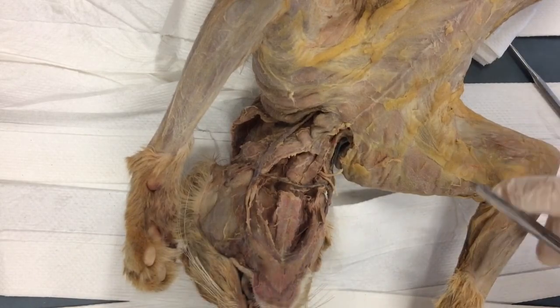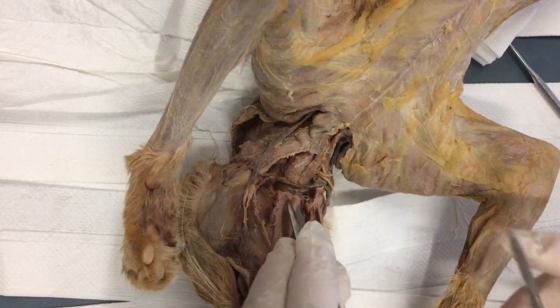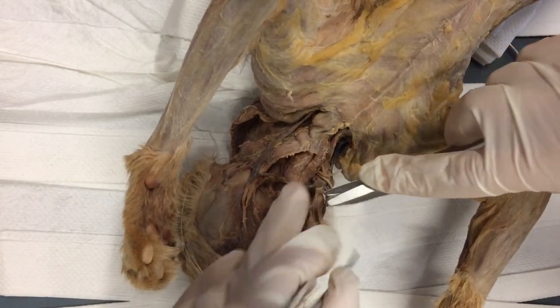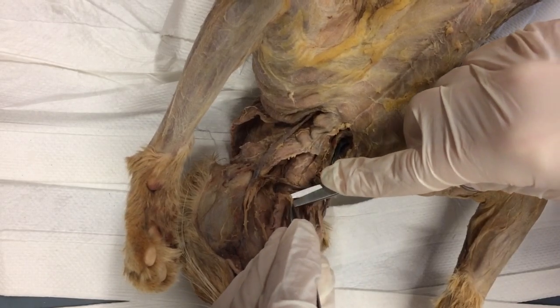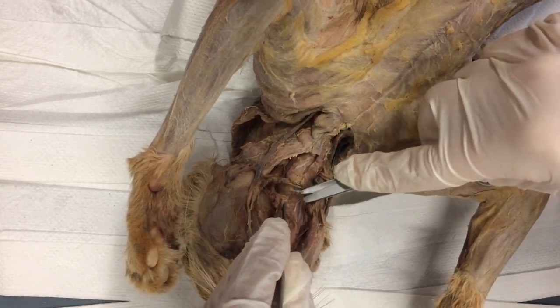This is where it gets crazy. I'm gonna need you to tilt these scissors just enough to cut this muscle off of this one, but not damage either one of them. So watch. I'm gonna come in from the side, put the sharp side away from you, and I'm just gonna, right where it's, if you look right there, see where it's real white and tight? Look, I'm just gonna go right, boom.